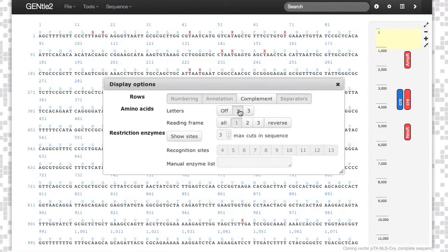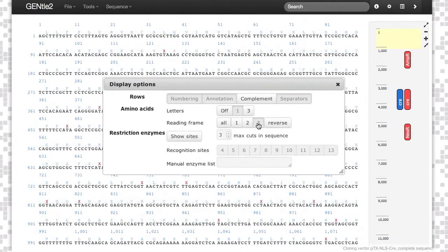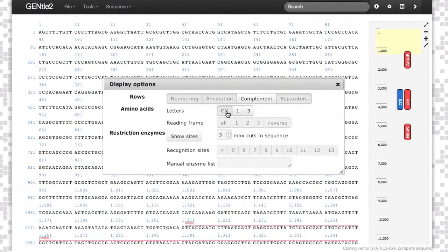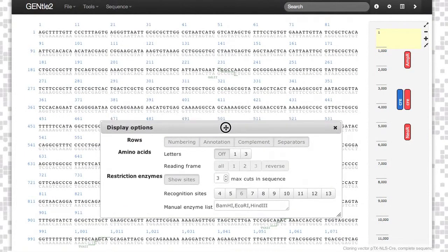You can also view your amino acid code in different reading frames. You can also show restriction sites, which will automatically show the complementary strand and the cut site.